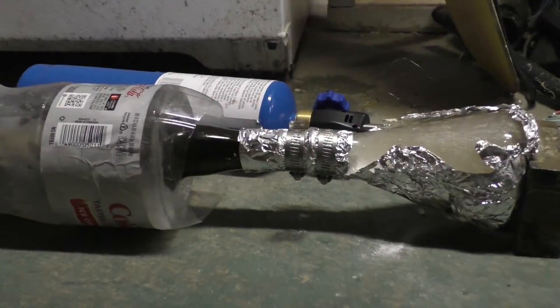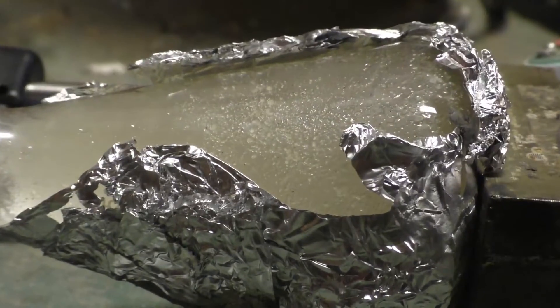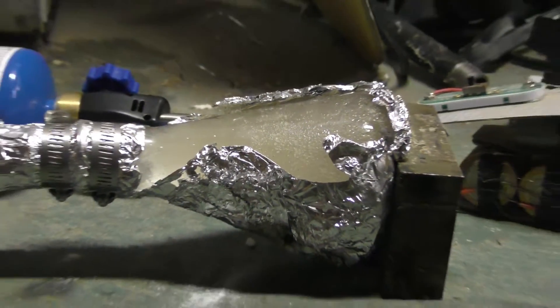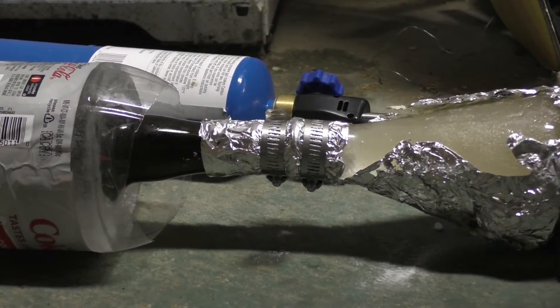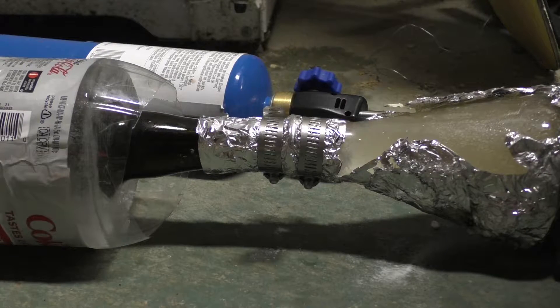I used aluminum to couple the reaction chamber to the distillation device — and don't use aluminum, don't do it. It's not a good idea because between the sulfuric acid and nitric acid, the aluminum metal had a time. But it worked, kind of. You'll see.